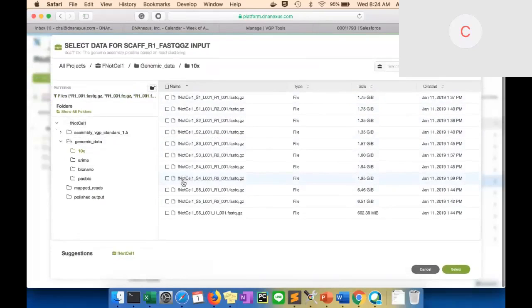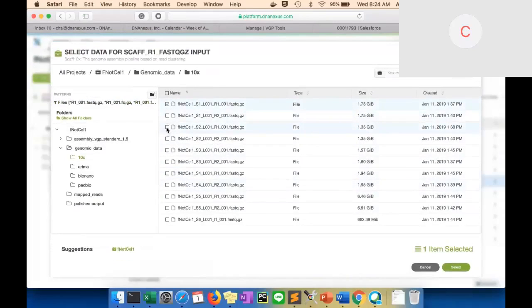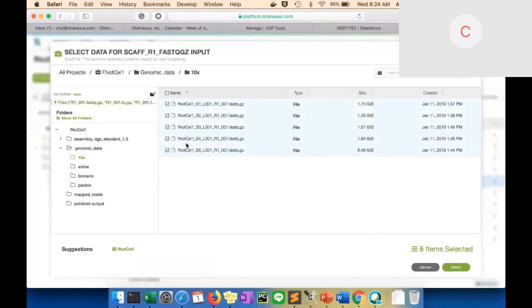But I just mentioned that it is a good sanity check to come to this and try to count whether you have the right number of inputs here. Say this is 5, and that's actually the same as what you saw earlier. So then you're good. But sometimes there might be more inputs here. So make sure that you come and take a look whether you actually use all the inputs that we have here. Yeah, that's all I want to share.